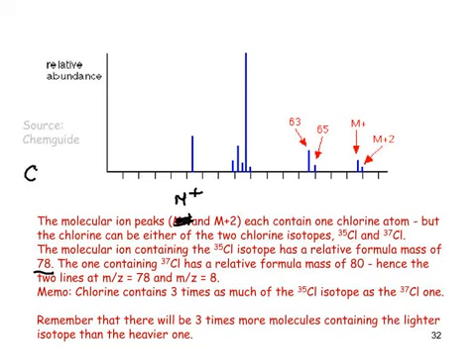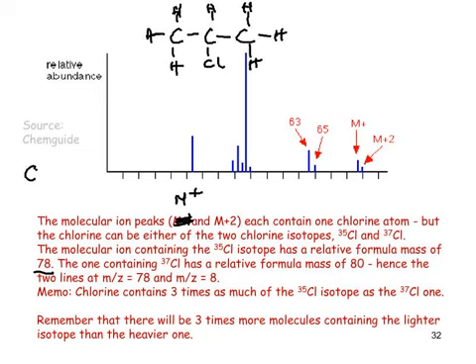It would be helpful here if this had come out. Some of this hasn't come out on this slide. Most importantly, the actual chemical hasn't come out, which is 2-chloropropane. So if you think of a 3-carbon chain here with a chlorine on the middle carbon, the rest are hydrogens. This is 2-chloropropane. It's made up of a total of 3 carbons, which is 3 12s, 36.